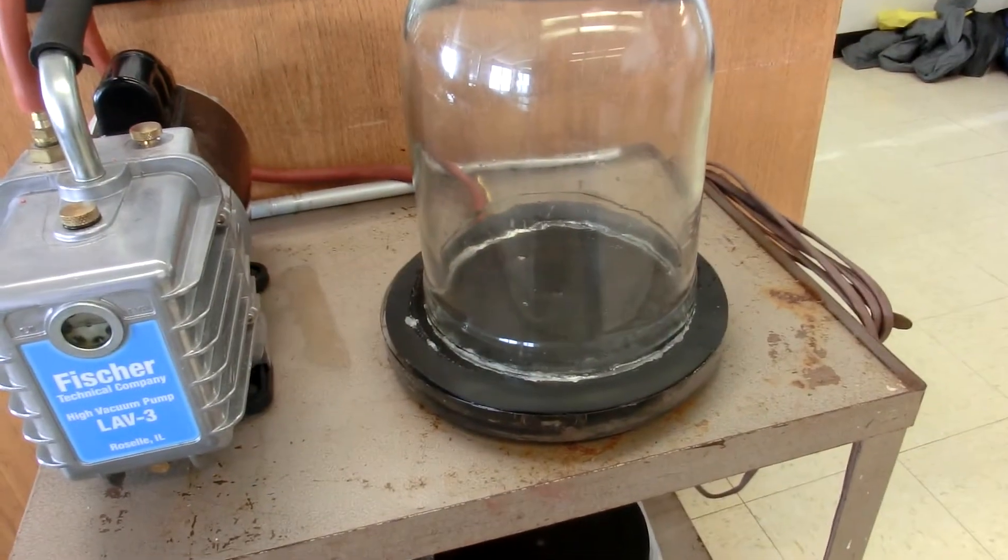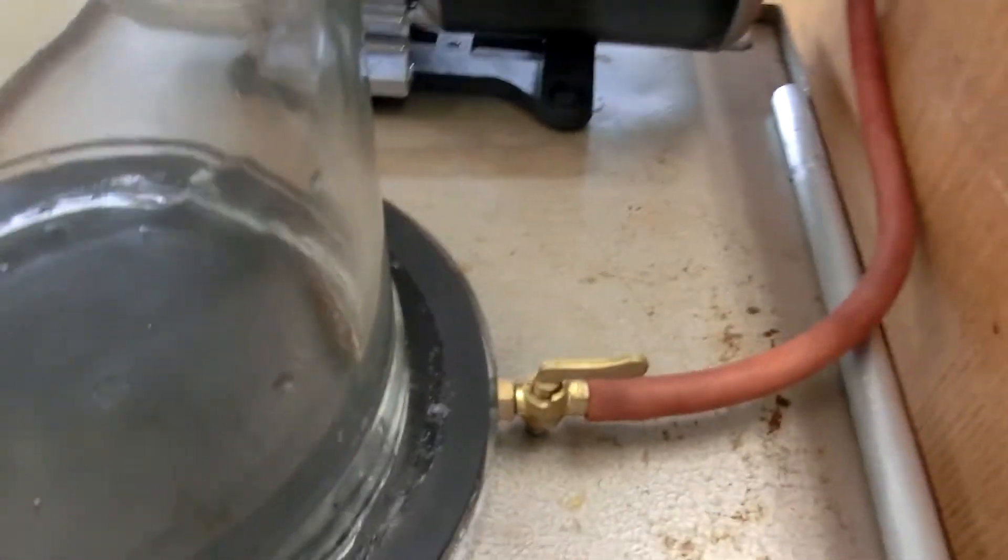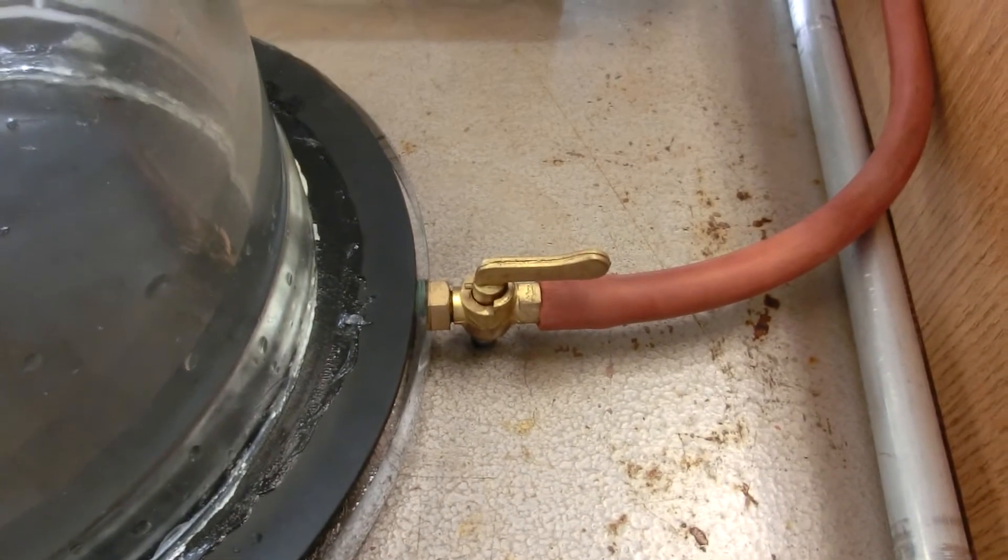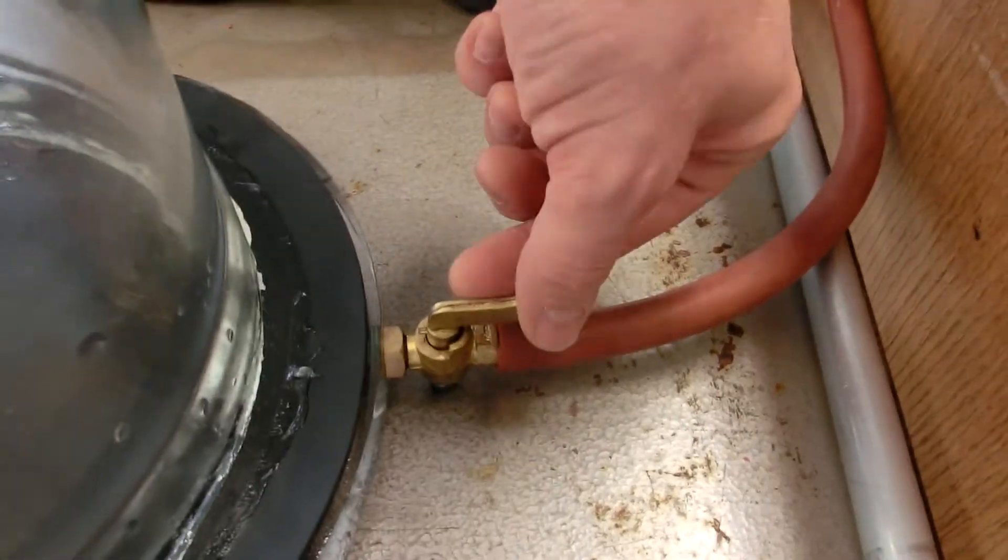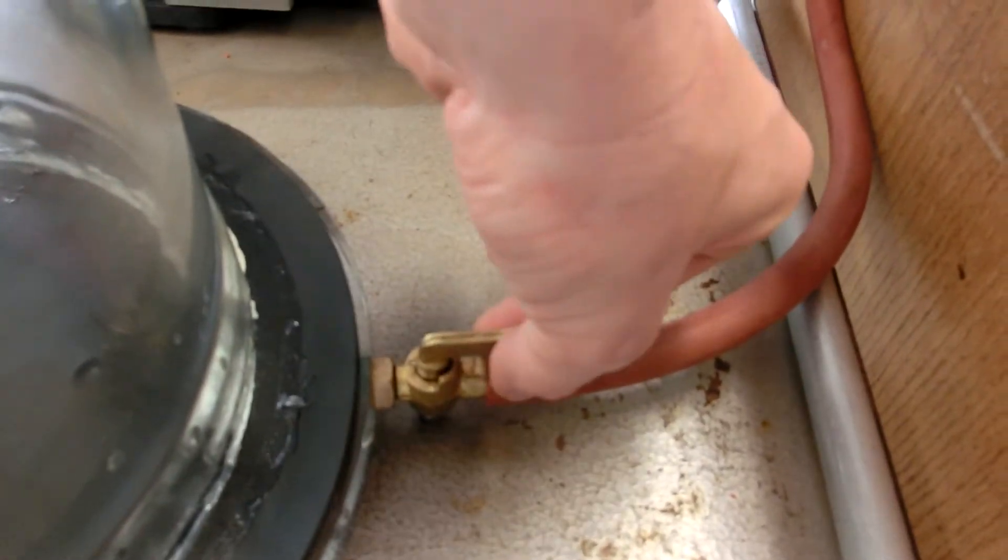And we have a bell jar set up. Let's take a look at the bell jar itself. You'll notice that the platform that the bell jar is on has a 90-degree valve. Like this it's going to be open, like that it's going to be closed. I'm going to leave it open for right now.